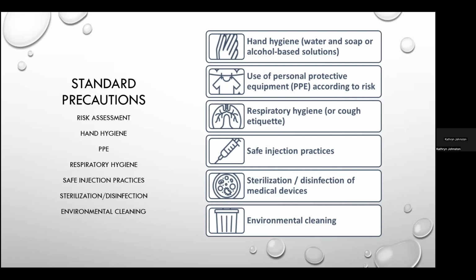And then it's important to note, though, that the effectiveness of standard precautions depends on how well the steps are followed, and they always, as I stated at the beginning, have to be preceded by a situational risk assessment, which we're going to discuss a little bit more in the second part of the talk.